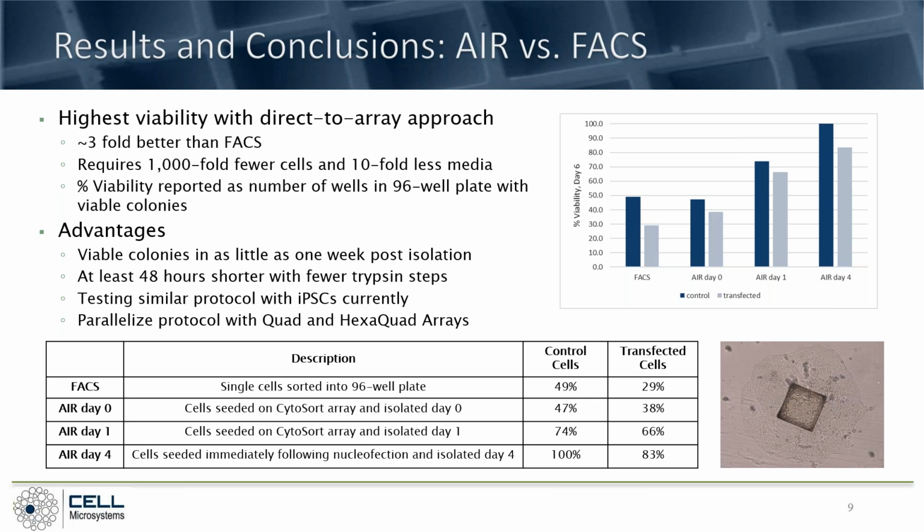And again, as I mentioned, using either a quad or a hexaquad array, we're able to parallelize this workflow to test multiple conditions, pooled guides, things like that.